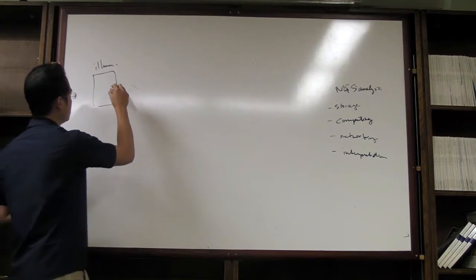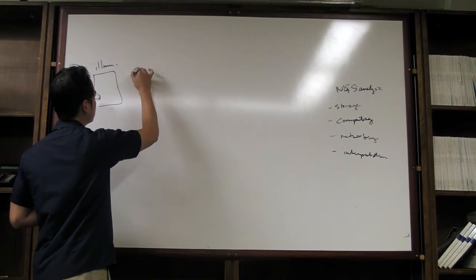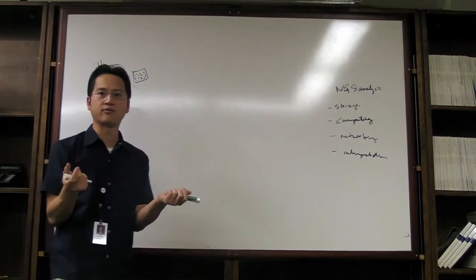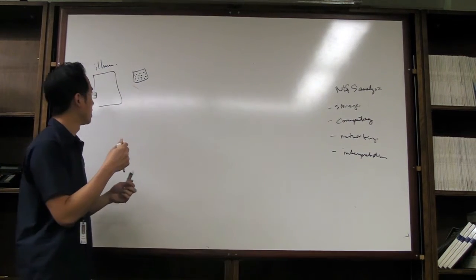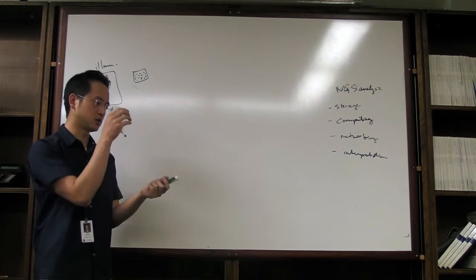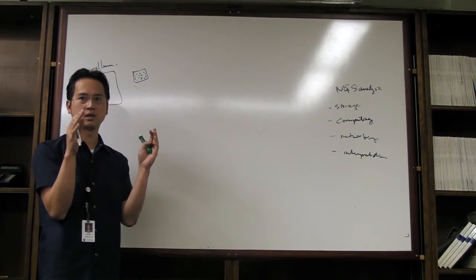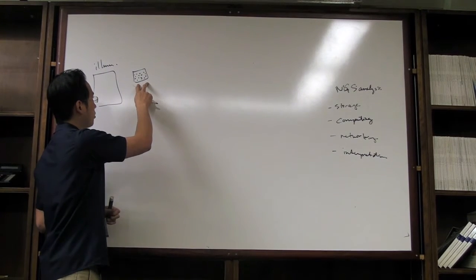During the sequencing, the Illumina would generate the images. If you recall the lecture on the platforms, it's sequencing by synthesis. You add on reversible dye terminators that you image across. You shine a laser on it, and it shines some color saying that it incorporated an A, T, C, or G. So you do this for various cycles.